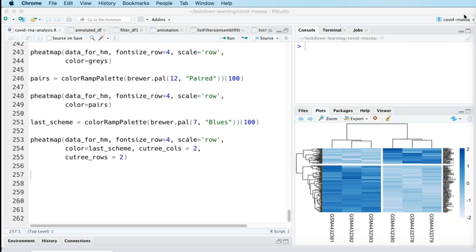As with all of these functionalities in R, we're going to need a package. And there's actually quite a lot of packages that apply these kinds of statistics in Bioconductor. Historically, I've recommended a package called GoStats, which is quite a nice package for this analysis, but quite complicated.